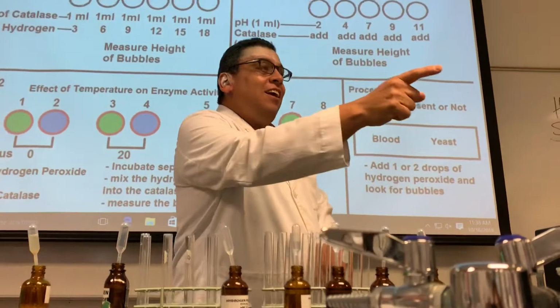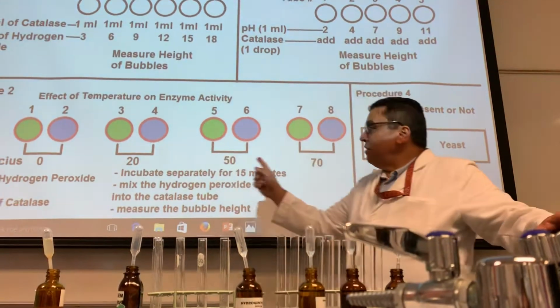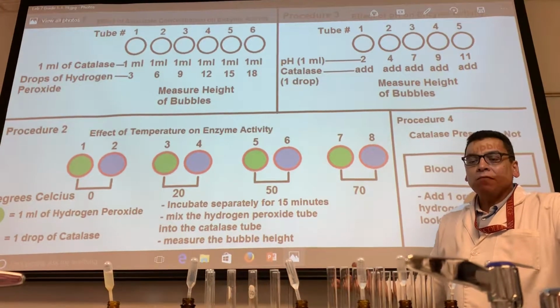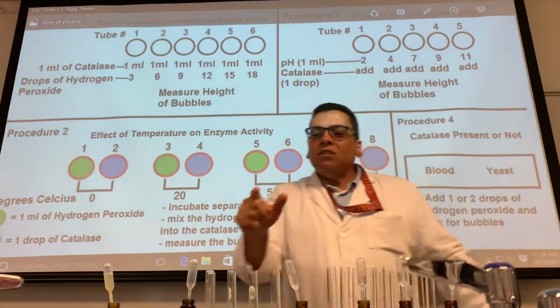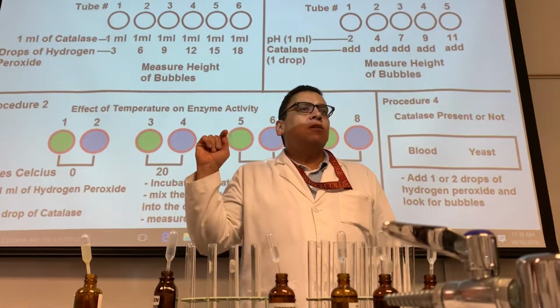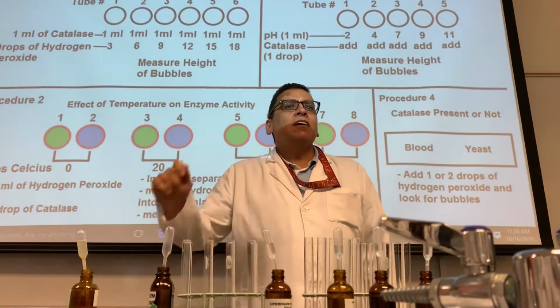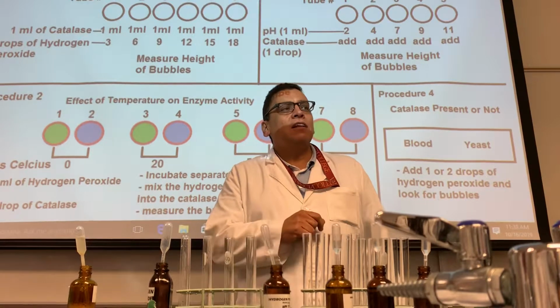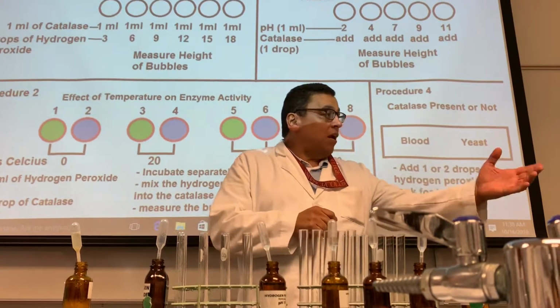Add heat. Isn't that what we're doing? That's heat. Okay. We also said that if you heat a protein, you will eventually do what? When you heat a protein, you will eventually do what? Denature. Denature it. Break it, denature it.